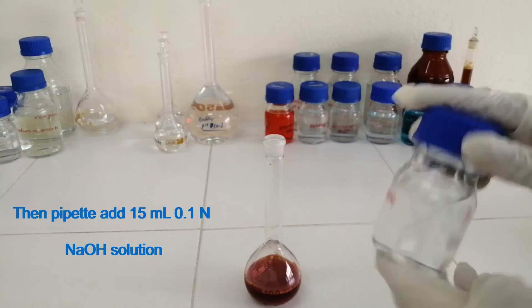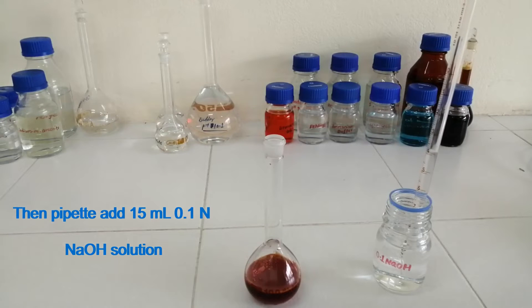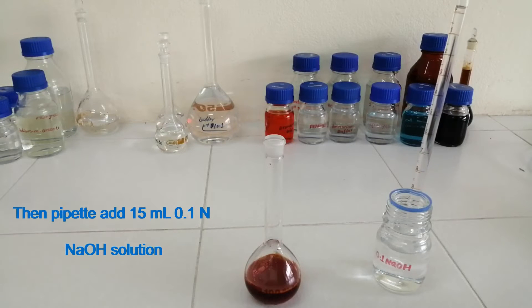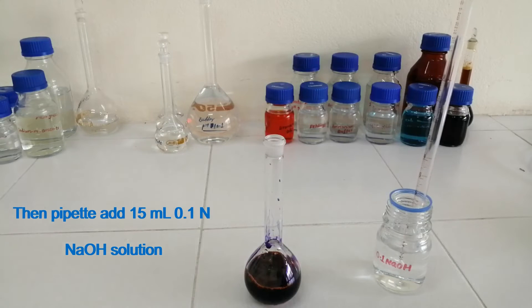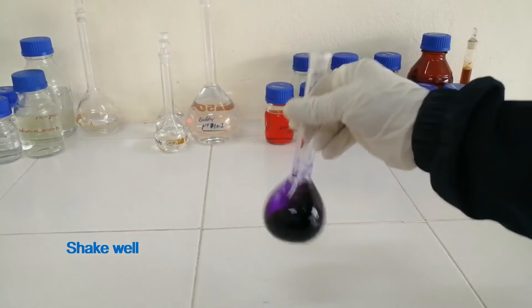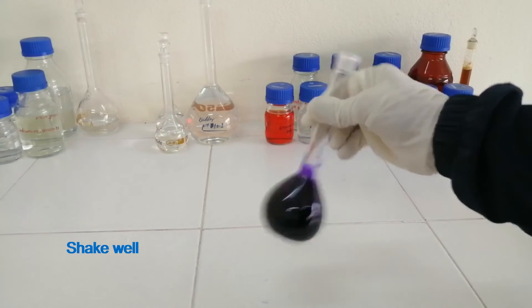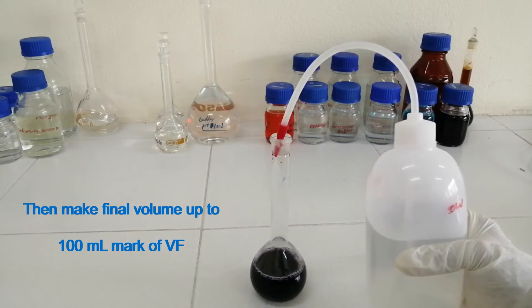Then pipette and add 15 ml of 0.1 N sodium hydroxide solution. Shake well. Then make the final volume up to 100 ml mark on the volumetric flask.